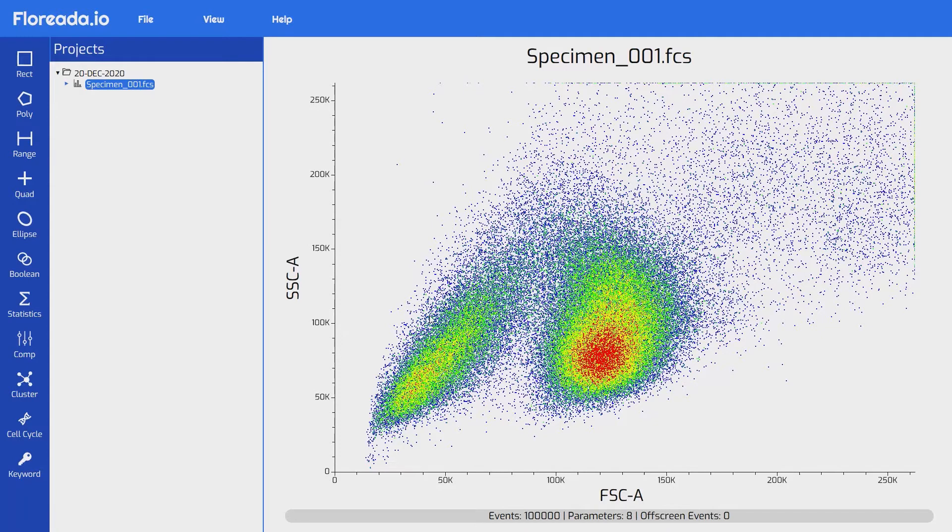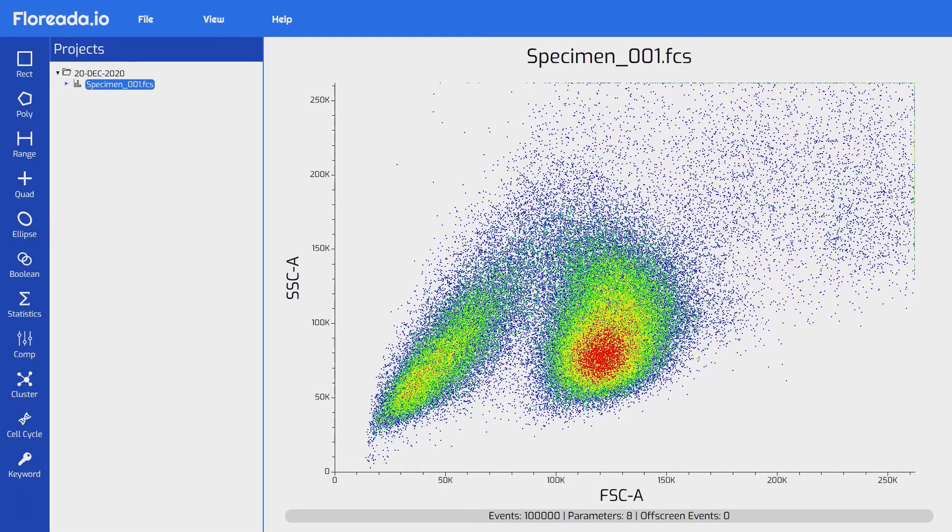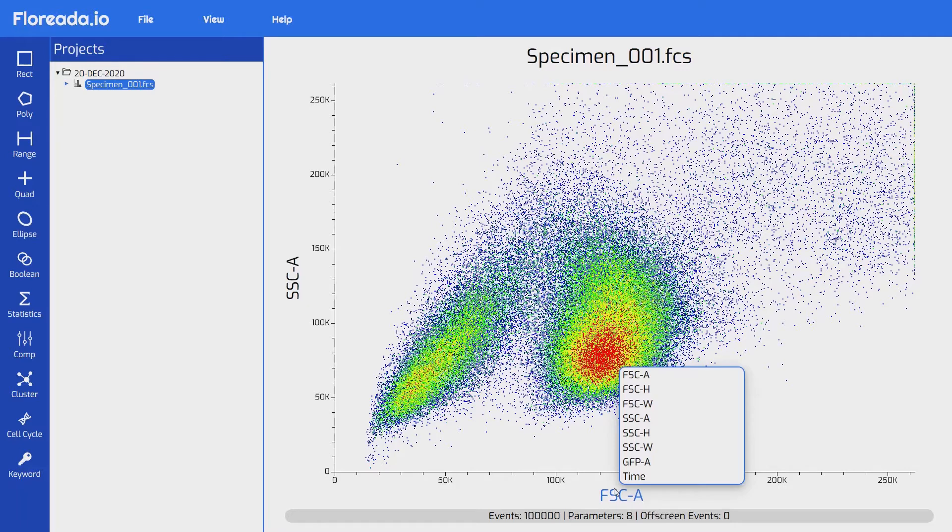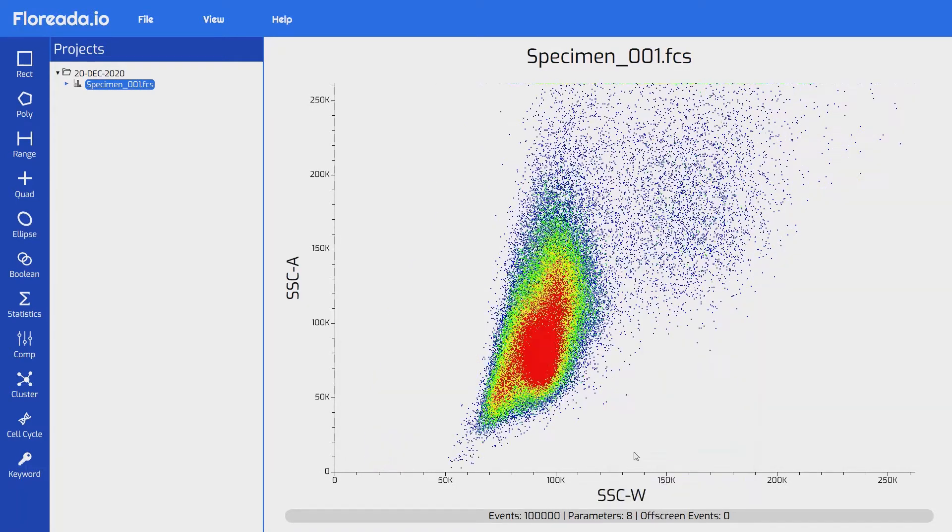The first thing we'll talk about is how to select a specific parameter for an axis. To change the parameter displayed on the X axis, just click on the current parameter name. That will open up a menu with all the parameters within the file, and we can select the one we'd like to see on the X axis. I'm going to select this one.